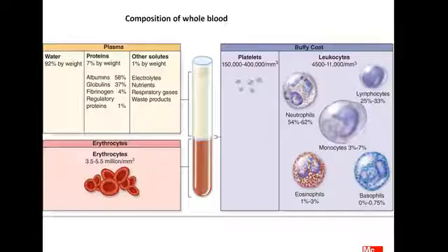These are the granulocytes. We can differentiate between them by their nucleus. The neutrophil has a multilobulated nucleus, 3 to 5 lobes, bound to each other by a thin thread of chromatin.